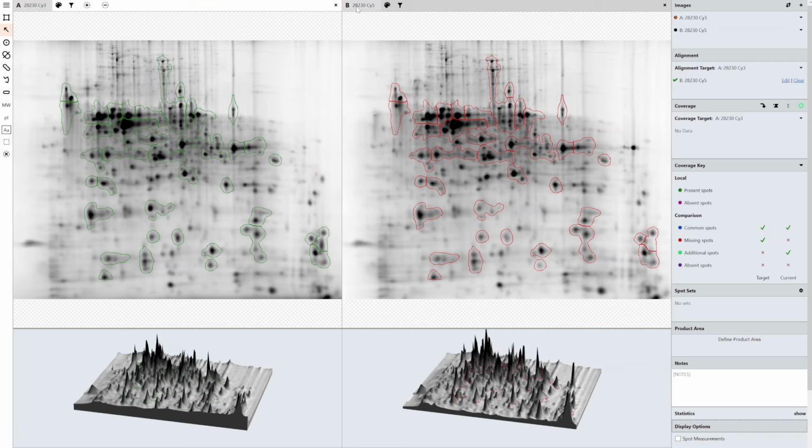So we've got a date or a random string of numbers, and then we've got a CY5 channel and a CY3 channel. It's not hugely informative for a user, especially if someone that didn't run the experiment is the one doing the analysis, or if someone comes back to the experiment in 5, 6, 10 years time and they want to know what was being worked on. This is not going to help them.